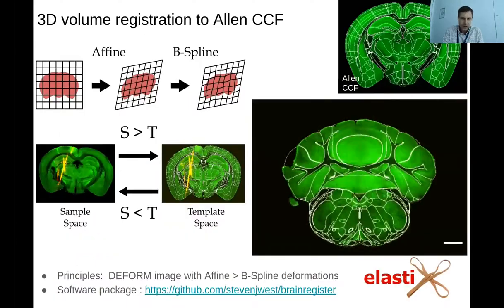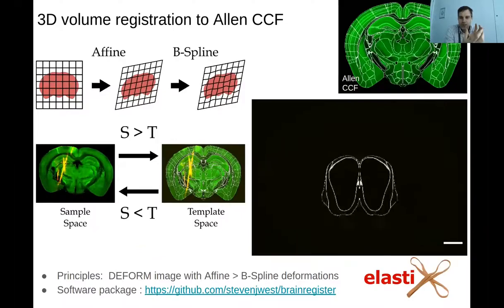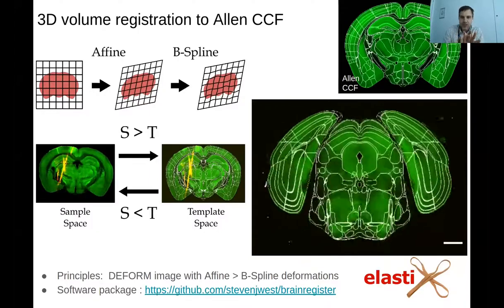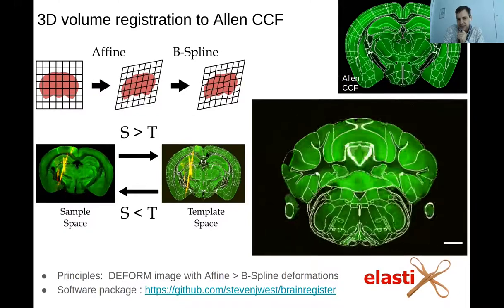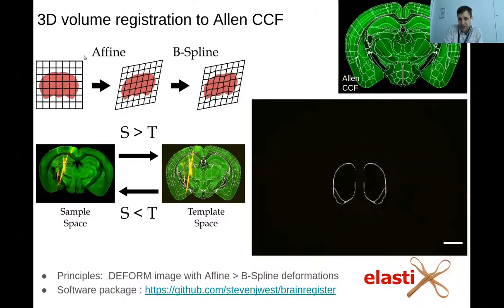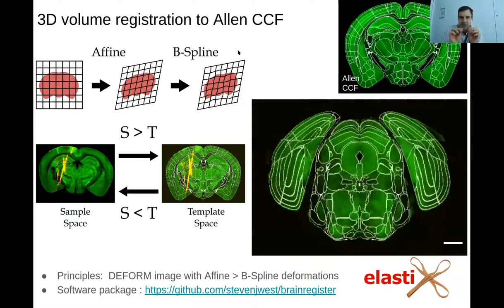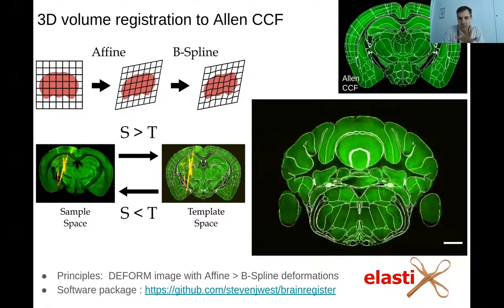Once you have your image volume, the next step is to essentially map that volume into the Allen CCF space. Because you have the whole 3D volume, we can do this in a much more automated way than methods like serial sectioning onto slides. There are a number of different image deformation and registration frameworks out there. The one I've been using for registration in the IBL pipeline is Elastix. The deformation takes place in two steps: first you deform your sample using an affine transform to overlay the atlas — that's a linear shift — and then once that's well aligned, you perform a B-spline optimization on top of that, which performs nonlinear alterations to the shape of your sample to overlay the atlas much more precisely.